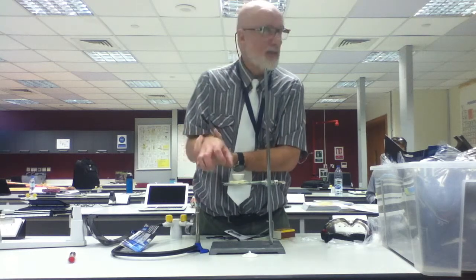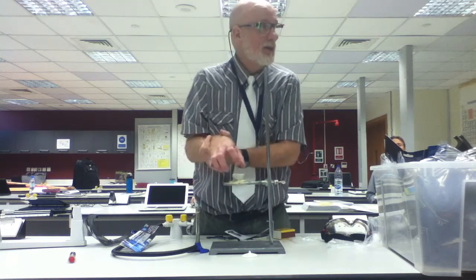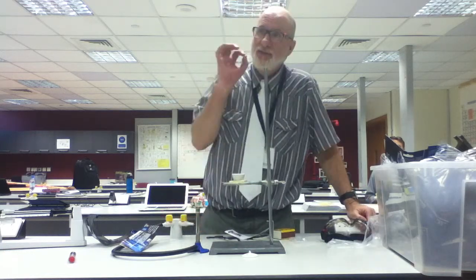Do you understand that safety at this level of chemistry is almost entirely common sense? If I gave you an Erlenmeyer flask, and it said on that flask, acid, would you do any of the following, true or false?